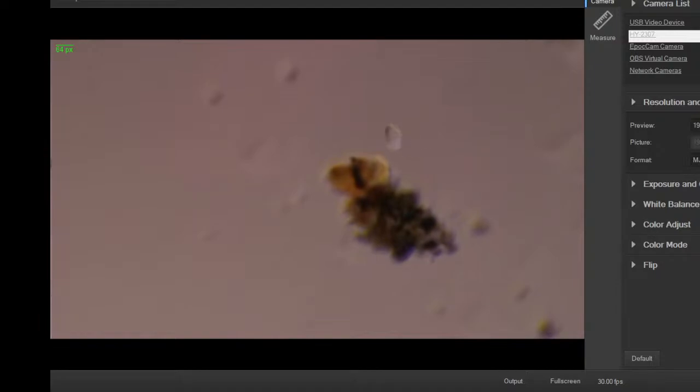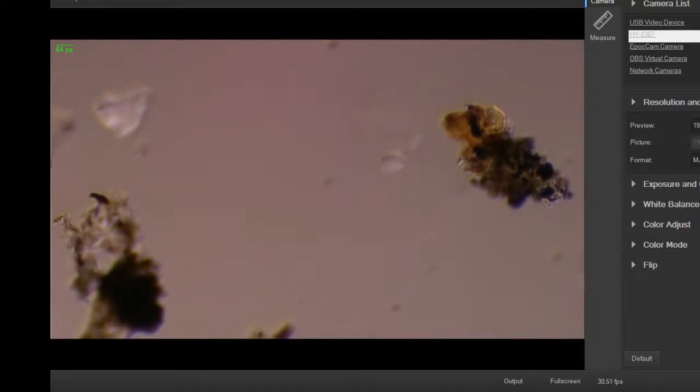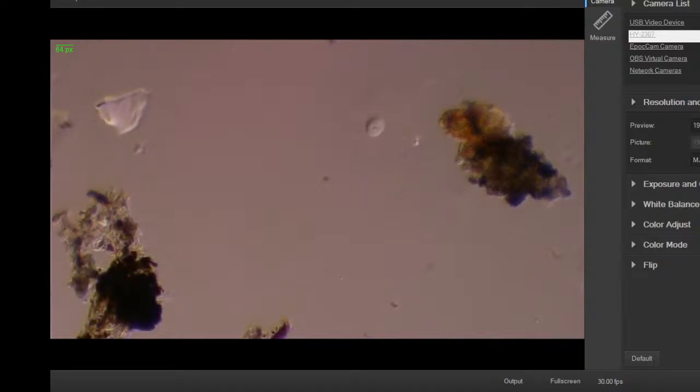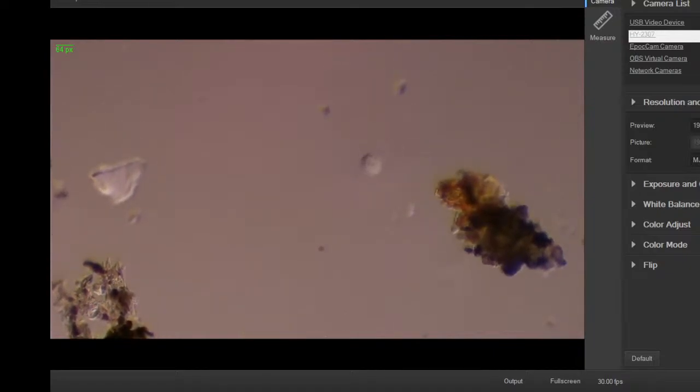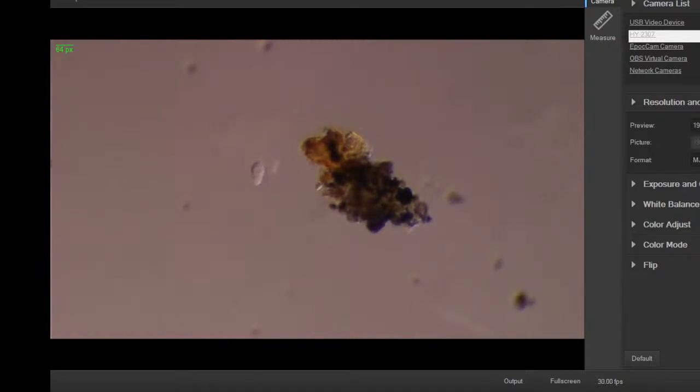This is another puddle of rainwater. This one's in a more trafficked area. I had a lot more cars driving through it, people, dogs, in general. Some leaf debris, you can see the colors here from all that, but also some darker stuff I was picking up with it. It's gonna be dirt. This guy definitely moves like a flagellate. It's got the kind of jerky motion. It's going in a circle a bunch, but when he moves, he's kind of jerky looking, and tumbling, like he has less control of his swimming technique.